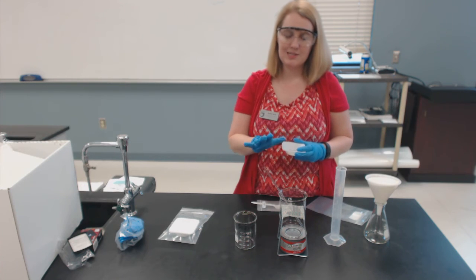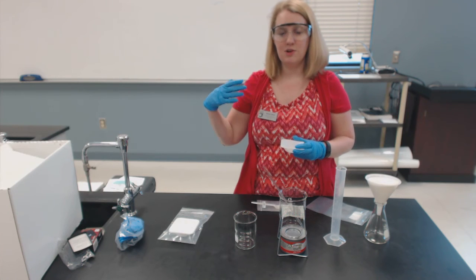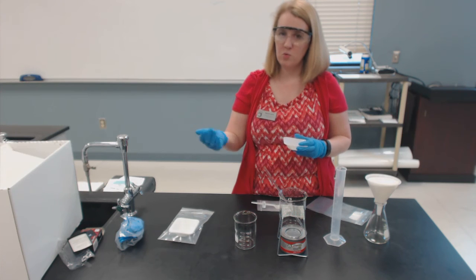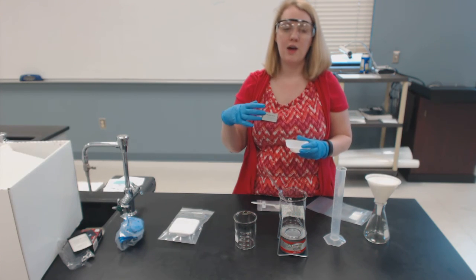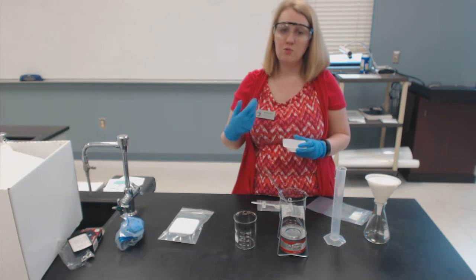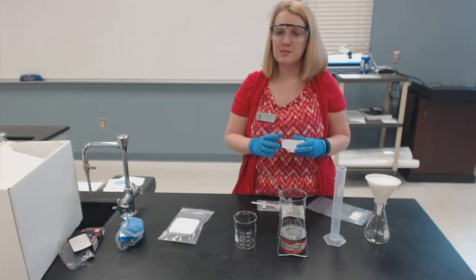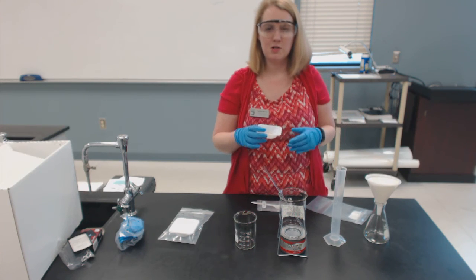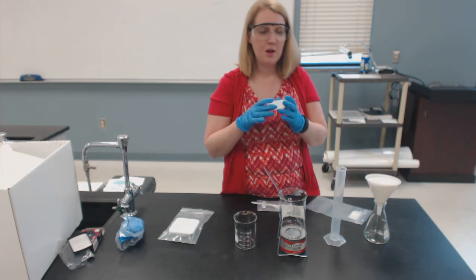So make sure when you're doing this lab, you do this in a well-ventilated area. Do it somewhere that either has an exhaust fan that hooks outside, or by an open window or an open screen door or something, or even outside on a patio. That way you're not breathing in the fumes. They're not really dangerous, but they could be a mild respiratory irritant. And certainly don't do this right underneath the smoke detector, because it's not smoke, it's vapor, but it can still mess with smoke detectors. So I recommend doing this in a well-ventilated area before you do it.